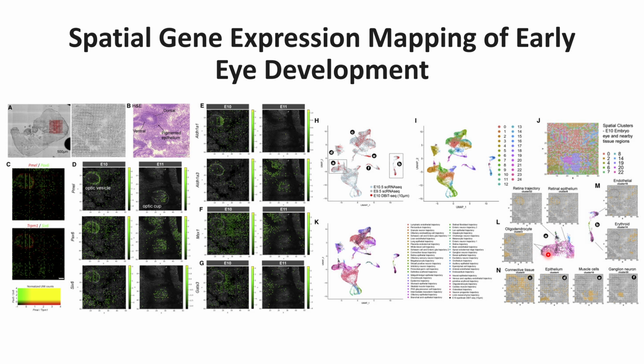So with the 10 micrometer channel, they are able to distinguish different parts of the eye development. And they did this not only for this A part, but also for this B part that has different clusters. B part has three clusters.